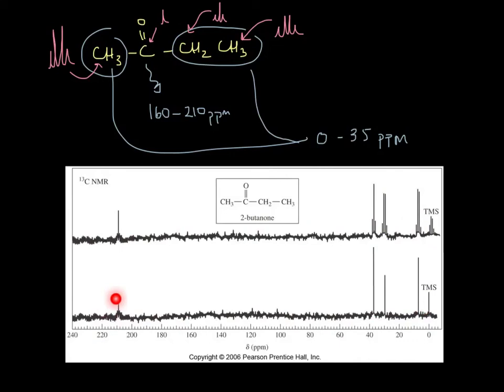If you get used to hydrogen NMR, we would never see this carbon right here because it doesn't have any hydrogens. But just remember, in carbon NMR, whether or not these carbons have hydrogens attached, the fact that they're carbons causes them to show up in NMR. And you can see in this case why integrating would be no good. This one is quite small, these two are quite tall, and really that doesn't mean anything in particular. It turns out that the more buried in the molecule they are, the shorter the peaks appear. So this carbon right here isn't attached to any hydrogen, it's kind of stuck in the middle, and you'll notice it's a little bit of a shorty. So that's kind of a general rule of thumb, but it doesn't really help us out very much.